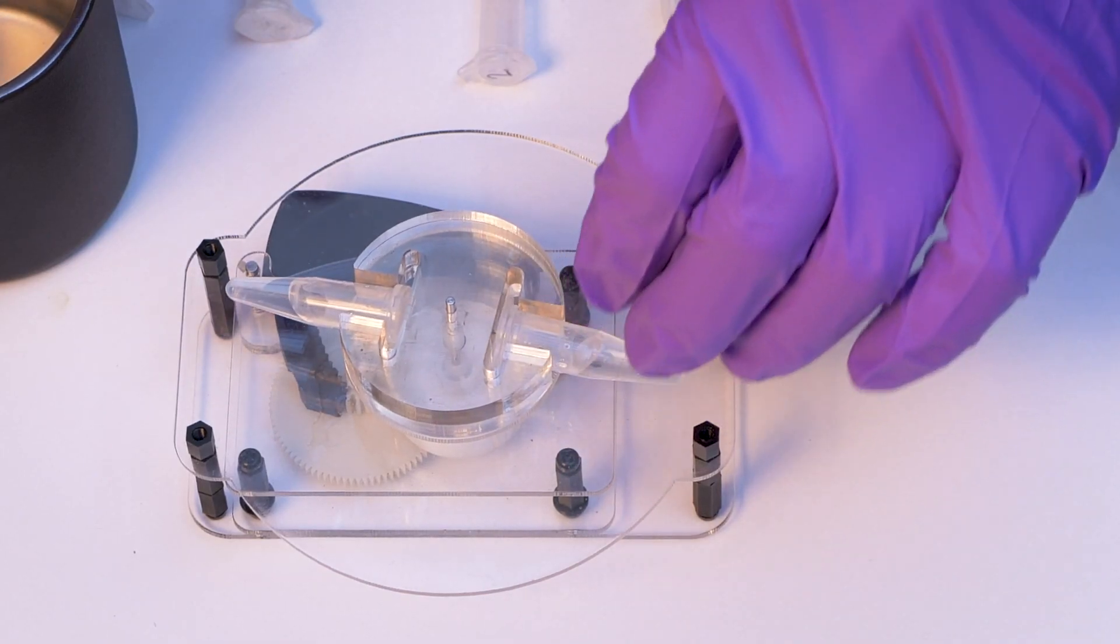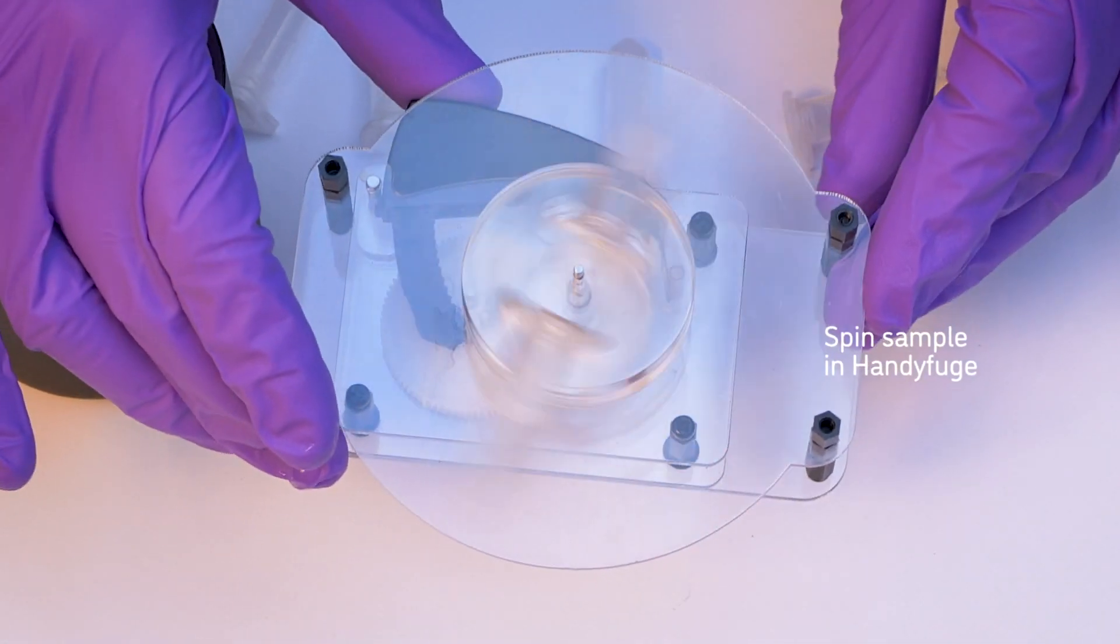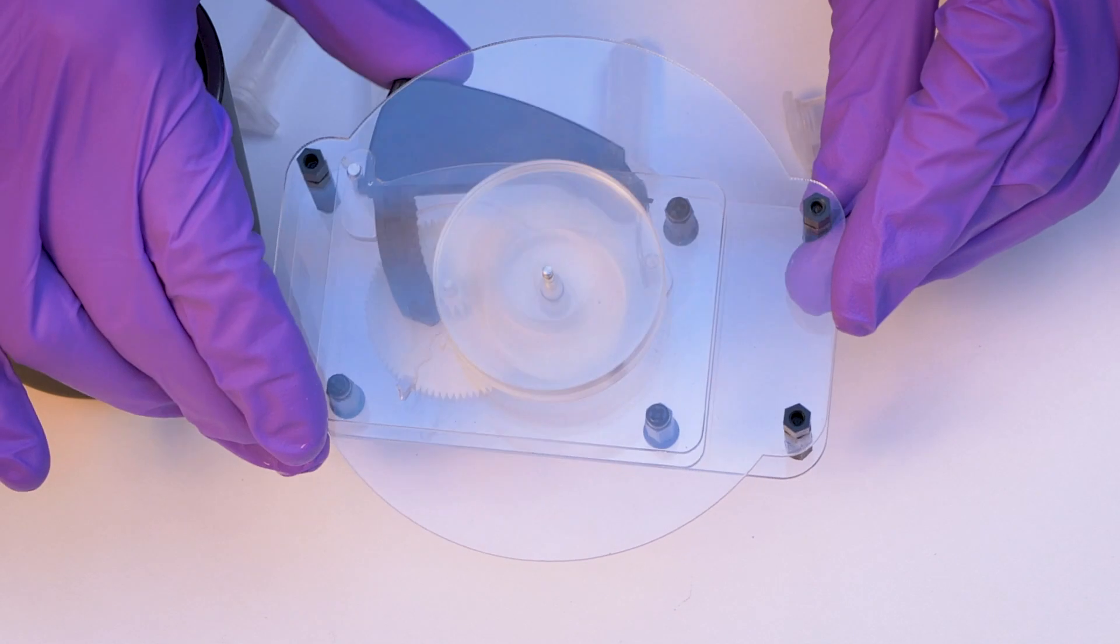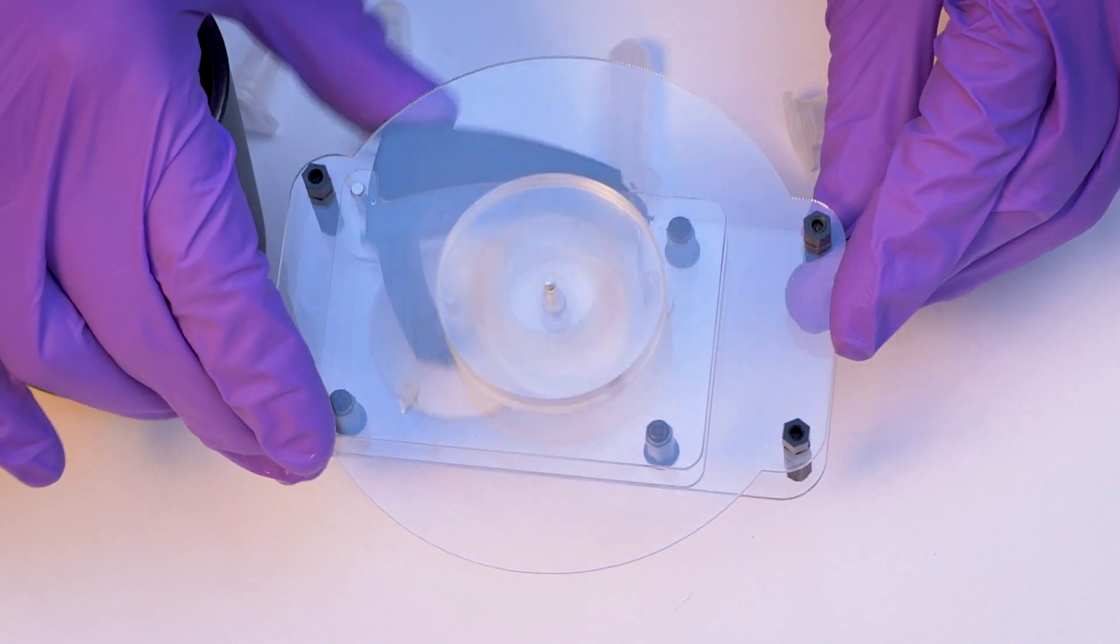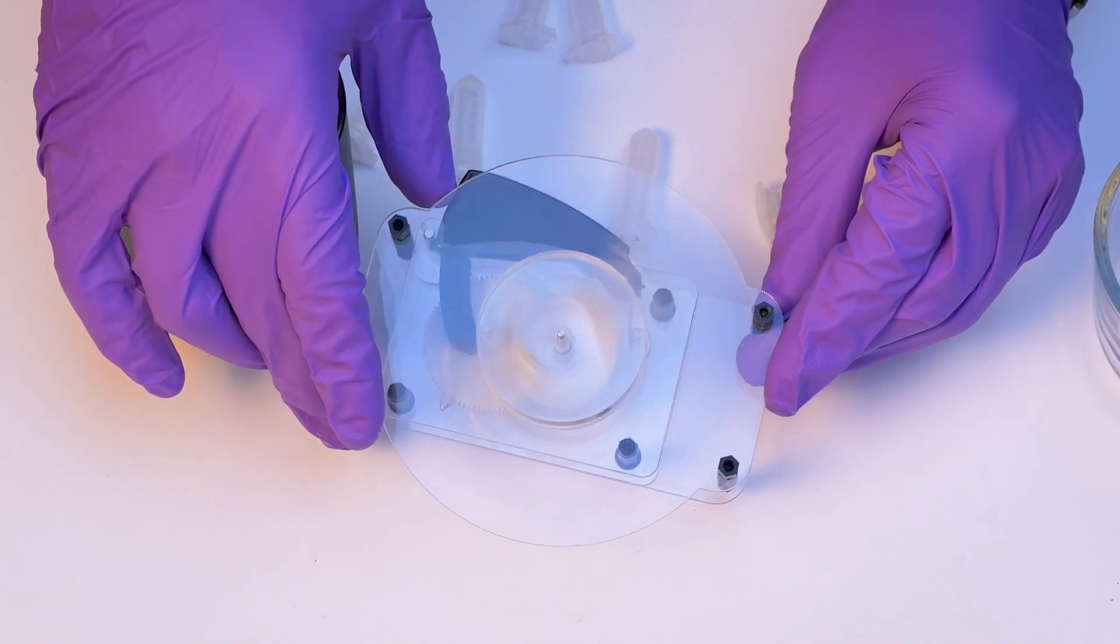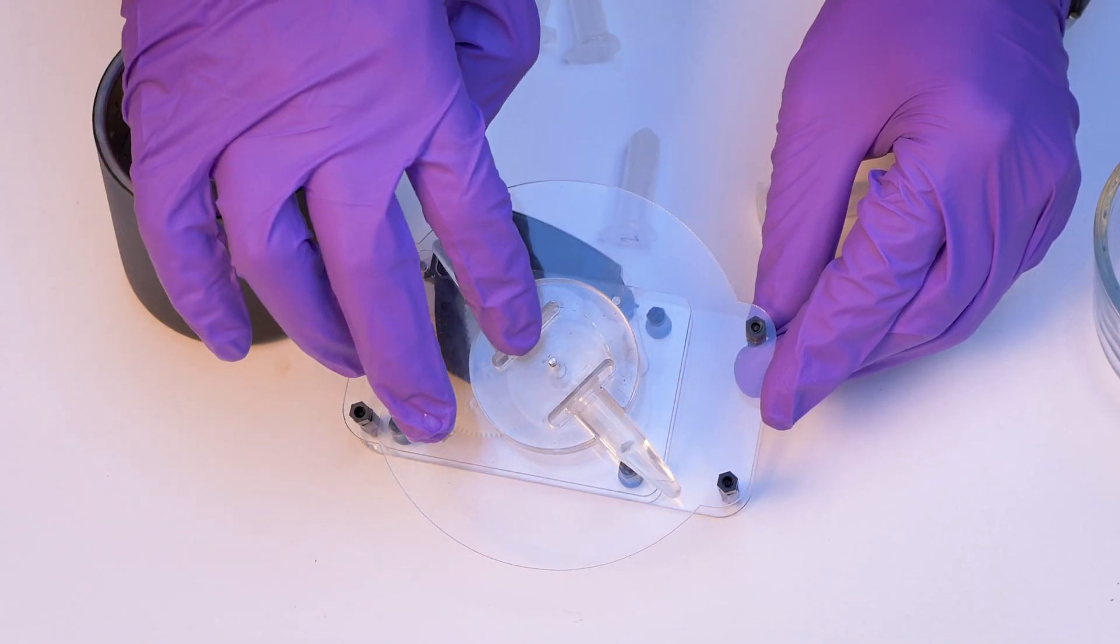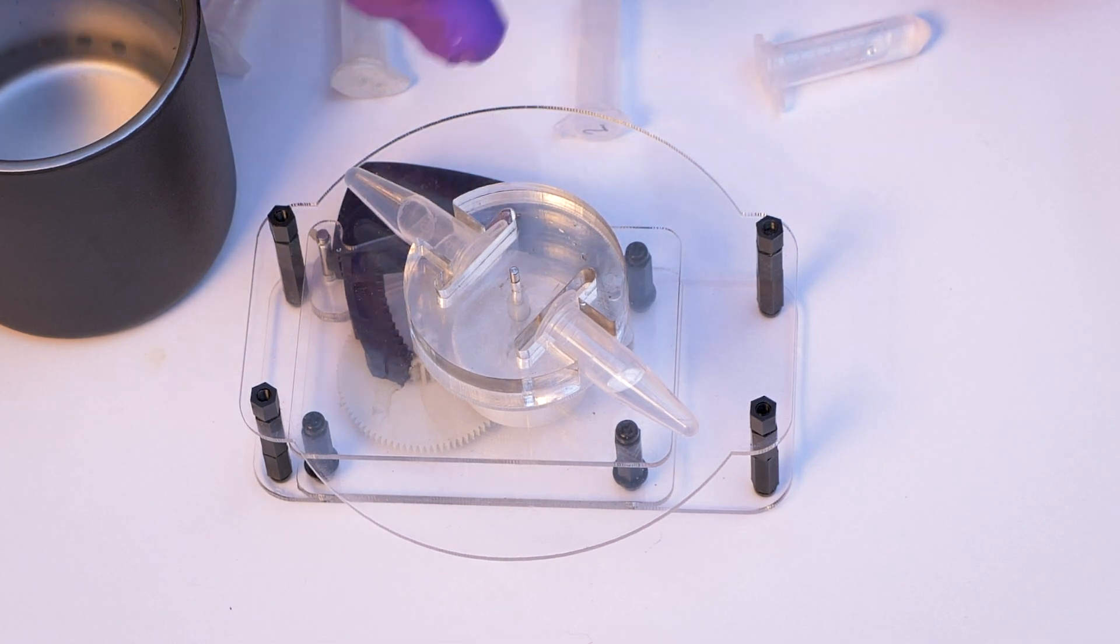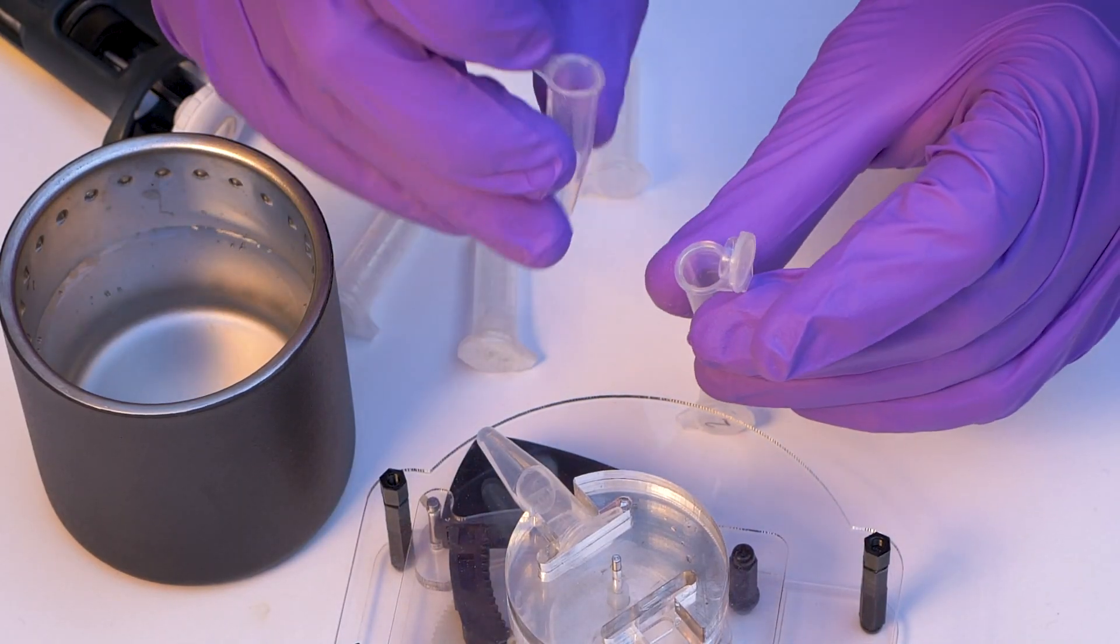The next step will be to spin this in a centrifuge. And so in this step, we spin down anything that will prohibit the reaction that we're going to use in the end to detect the virus. So everything that we don't want will be stuck at the bottom of the tube, and the viral RNA will be in solution. So we transfer it to a new tube.